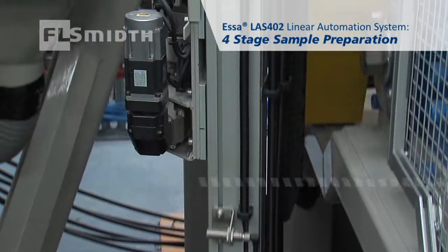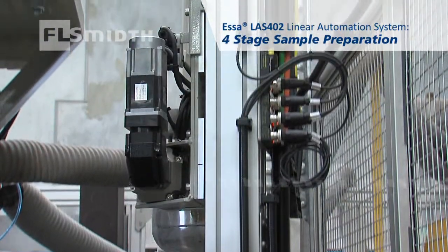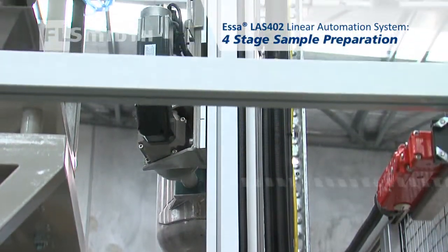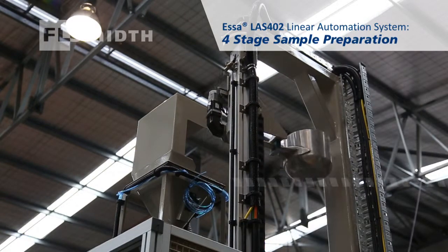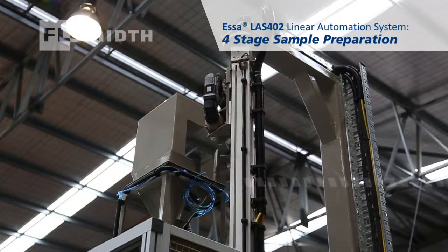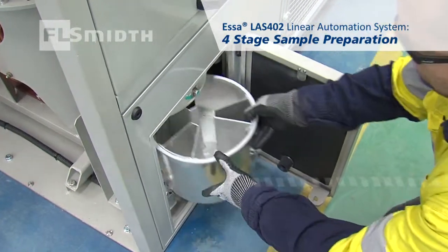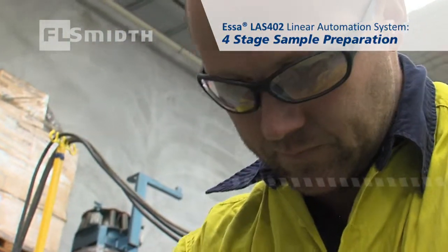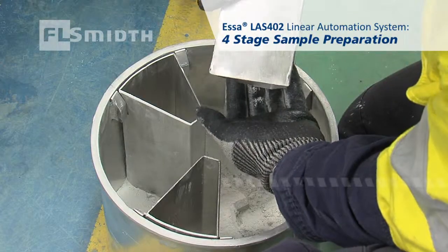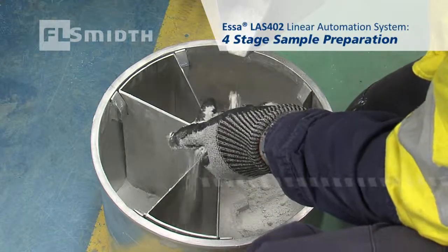Improved operator safety is a major benefit of this system. Inbuilt dust extraction minimises operator exposure to dust. Manual handling is limited to simply loading the crusher. The mechanical bucket lifter then does the heavy lifting until a final pulverised split is available for collection. The operator is protected from all external mechanical moving parts by protective guarding, locked safety switches and emergency stops.